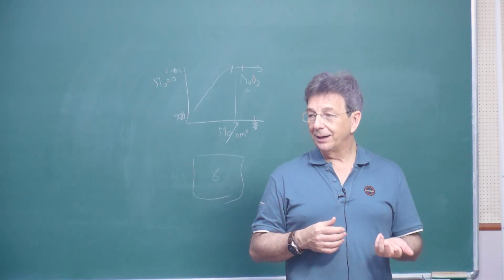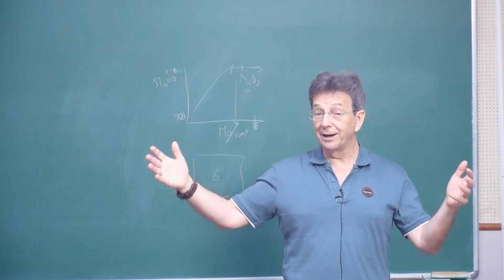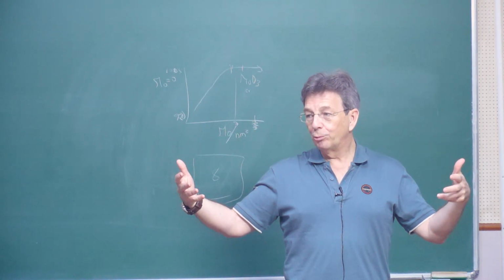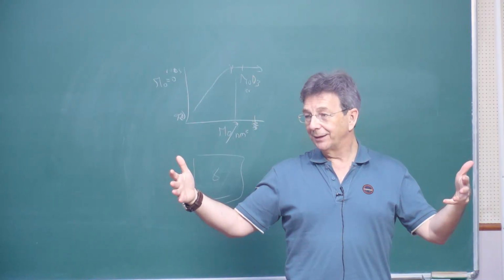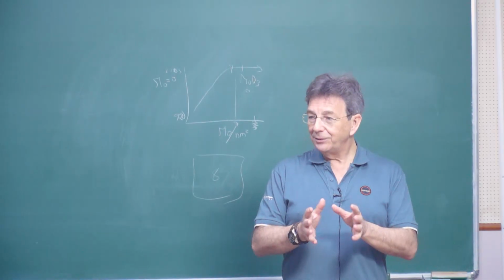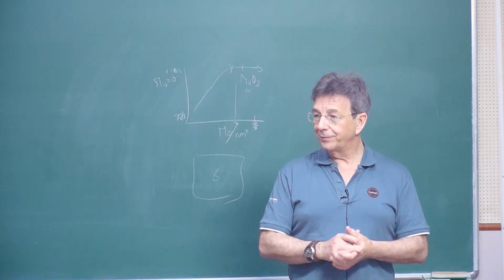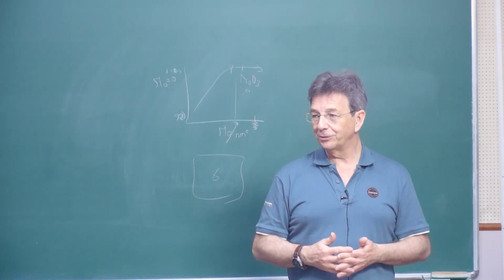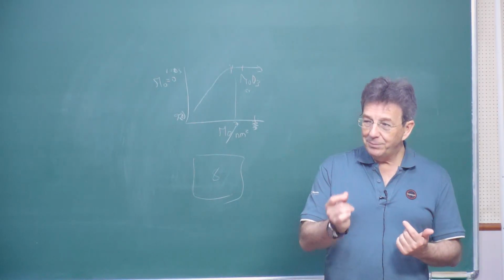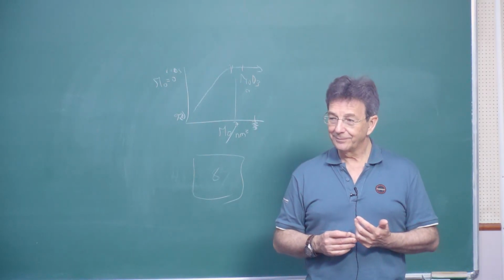You may even get some additional vibrations associated with some defects that you can hardly see in a large crystalline system, because in a large crystalline system, the regular periodicity of the overwhelming amount of atoms will dominate the characterization. When you go smaller, surface effects and defects will be more apparent, but in the end you will see the same thing, like vanadium pentoxide, you will see vanadium pentoxide. But you may see a little bit more of defects, but you do see essentially vanadium pentoxide. So the size is not really critical. That's the nice thing of Raman. Even the minimum expression of a crystal will be already apparent to Raman, which is nice.